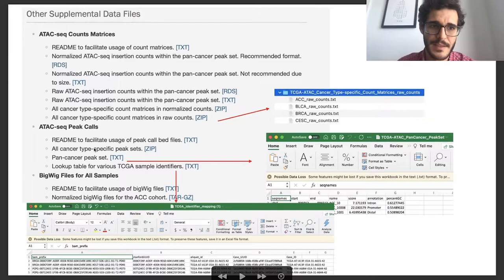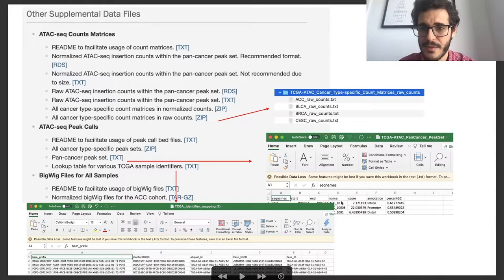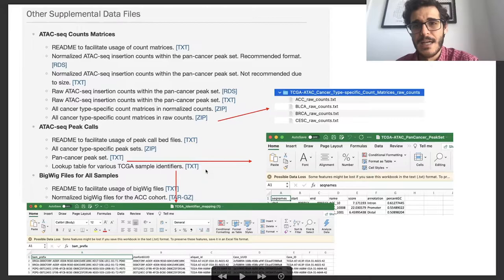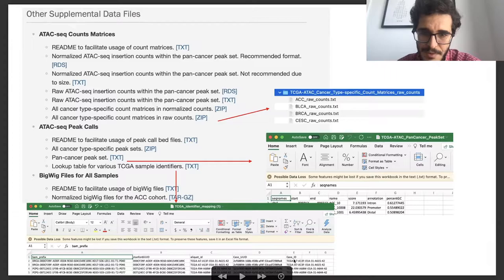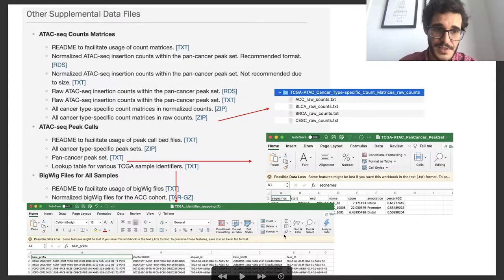Then we have the peak calls — these define the regions, showing chromosome start and end, the name of the peak, and the score. The last important file is the lookup table for TCGA samples. Most samples have a label using a Stanford UID, but all the metadata from TCGA uses what we call a TCGA barcode. You'll need to get this table, match the Stanford UID prefix, and then map to a TCGA ID if you want to get information from TCGA.